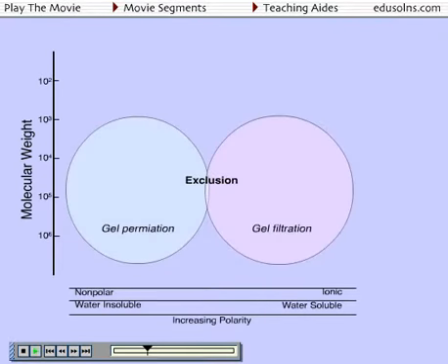Exclusion chromatography, which can be subdivided into gel permeation and gel filtration, operates based on separation by size, as the name implies. This is traditionally used in the identification and purification of large biomolecules. Ion exchange operates by using an analytical column to separate the ions and a suppressor column to absorb any counter ions released into solution. Both cations and anions can be analyzed. The mode of detection is a conductivity device.